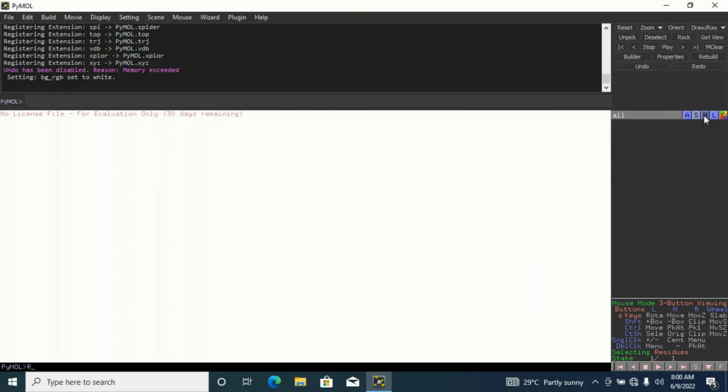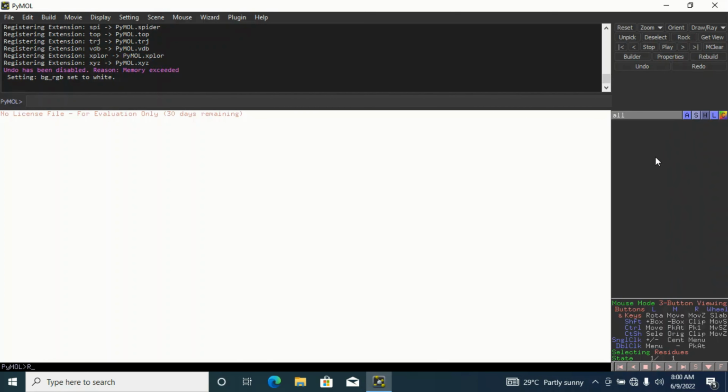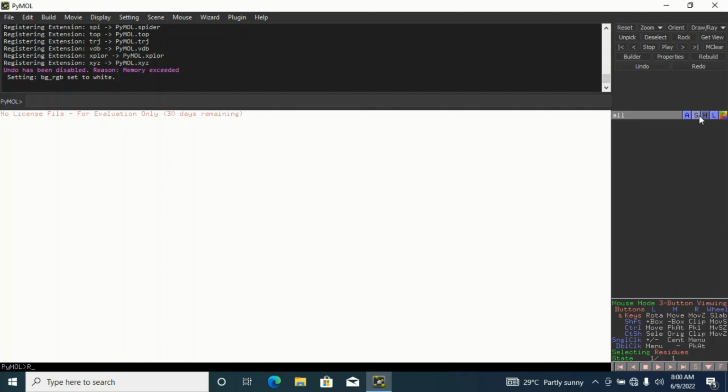We also have what? H. H stands for hide. If you want to hide any of those things you showed at S, S is for show, H is for hide. You can hide everything. You can hide wire, you can hide line, you can hide everything, just like you showed them here.